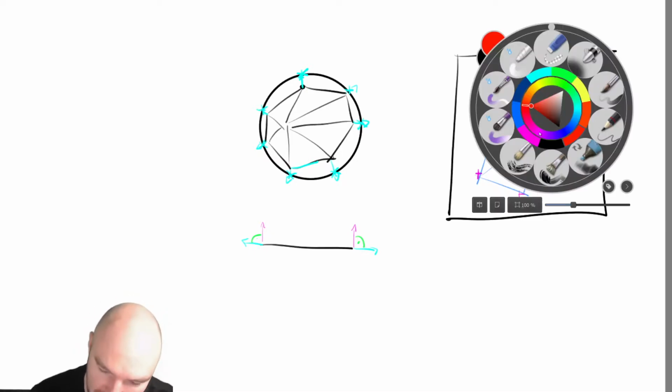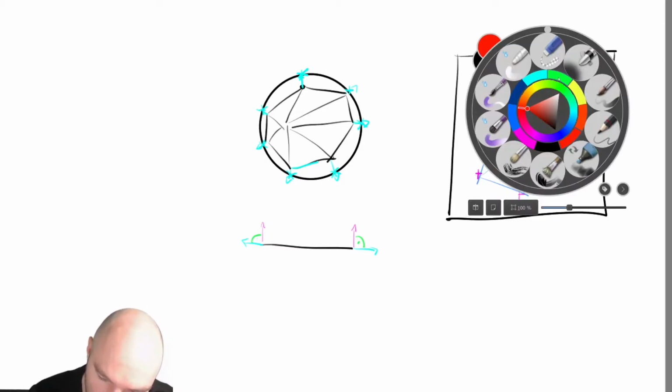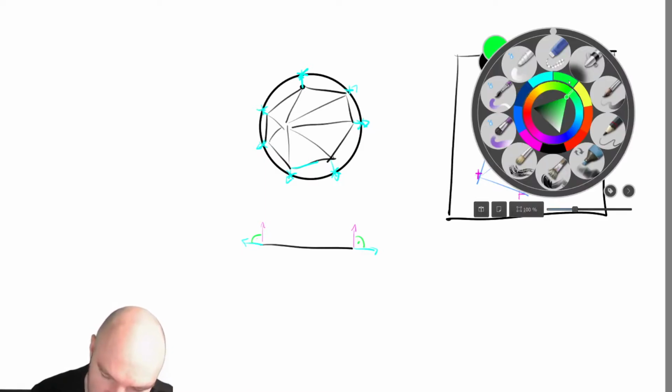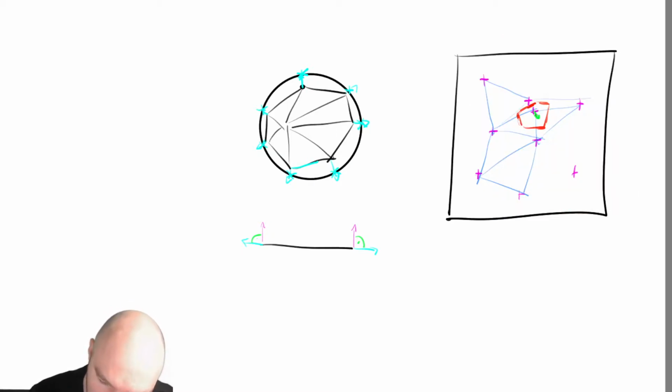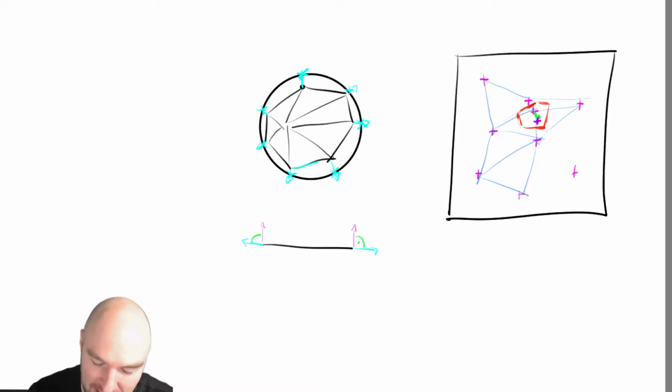And so the next step that we do is we move that point to the center, to the center of gravity, of that domain here, of that Voronoi cell. Obviously, my sketch was a bit off, so I've moved it outside of the center, but I think you get the idea. So if you have 2 points that are close to each other, they are going to drift apart.